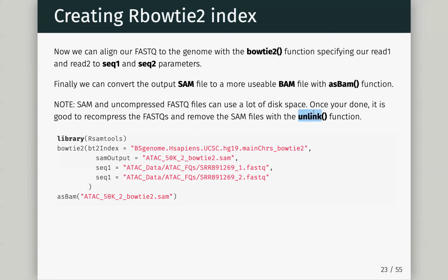Not sure if we've used this before. Have we used unlink in the class before? Probably deliberately not. Unlink means delete, so be careful with it.